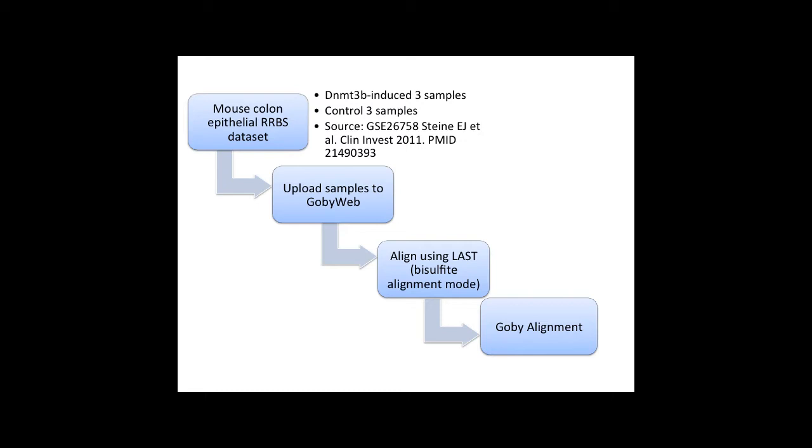All cytosines in a particular context, in this case the CpG context, are summarized and the methylation rate is estimated for a genomic window, that is the boundaries of the CpG islands. We then carry out a statistical test for the differences between two groups.